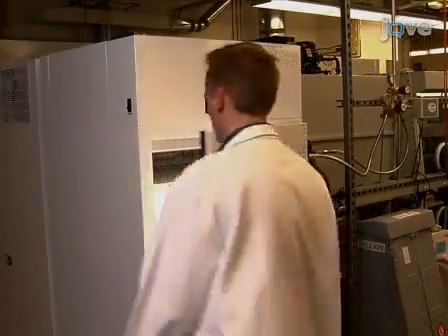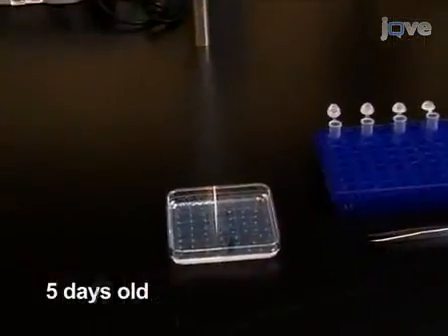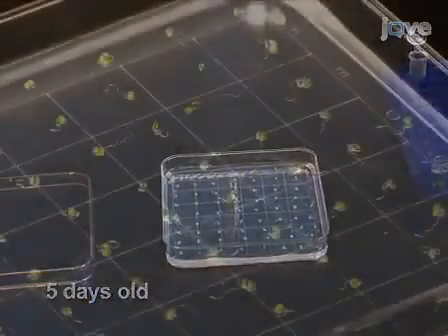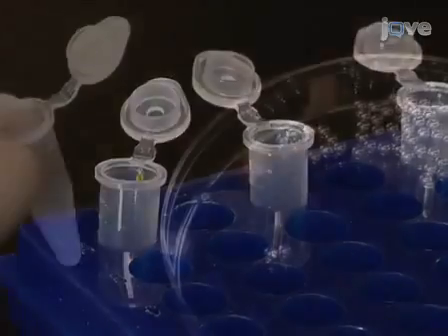Begin this procedure by isolating the extracellular matrix or cell wall of plant tissues. Harvest 5 Arabidopsis seedlings, or the equivalent amount of other plant material, and transfer them into a 1.5 milliliter reaction tube. Make sure that the material is placed at the bottom of the tube.